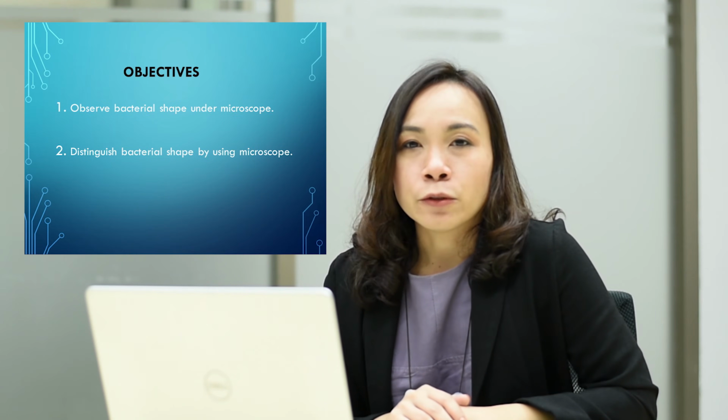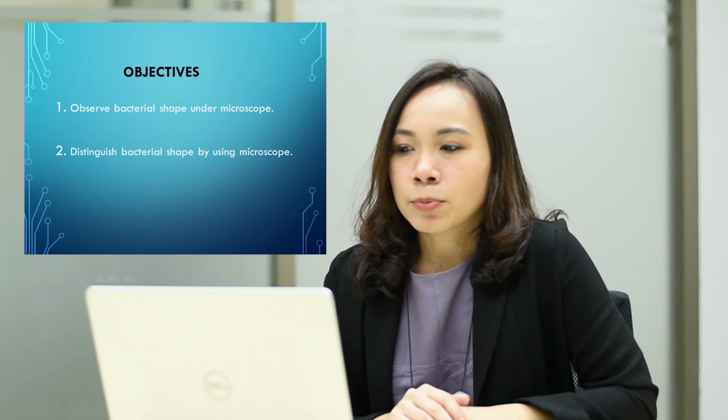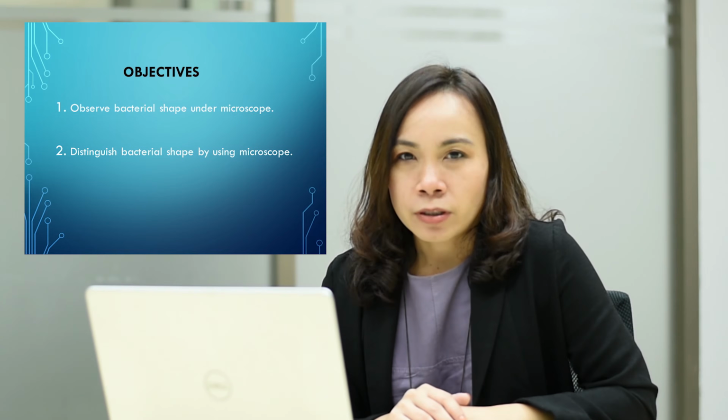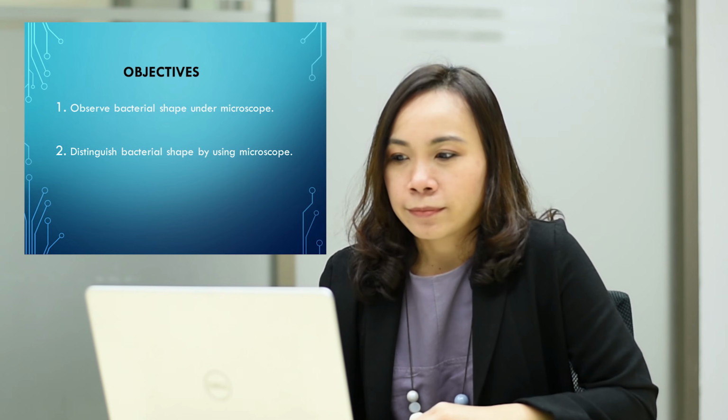Hello student, this is Laboratory 5, Microorganism. After completing this exercise, you will be able to observe and distinguish the bacterial cell by using compound microscope.